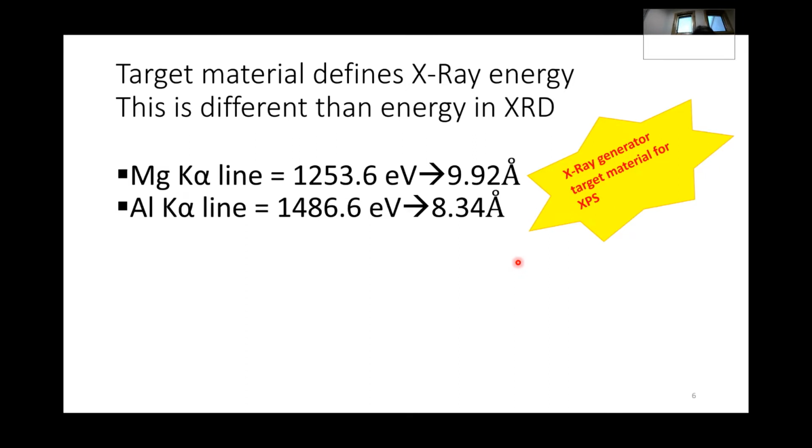XPS uses an X-ray source. The other instrumentation that we will explore, and we might explore XRF as well, but we for sure will explore XRD in this class. The other instrumentation that exploits, I guess, X-rays is X-ray diffraction. However, there are some distinct differences in the energy associated with the X-rays and the different instruments.